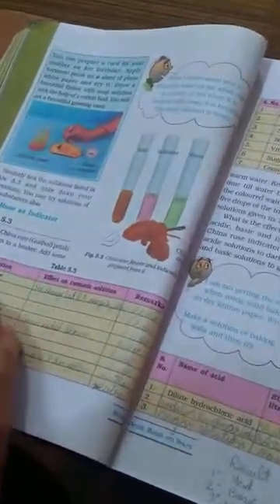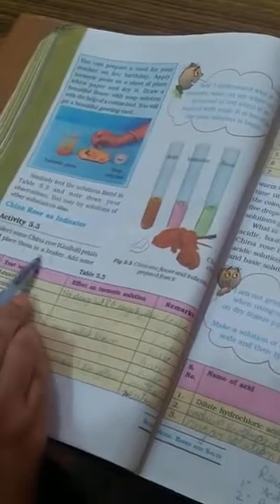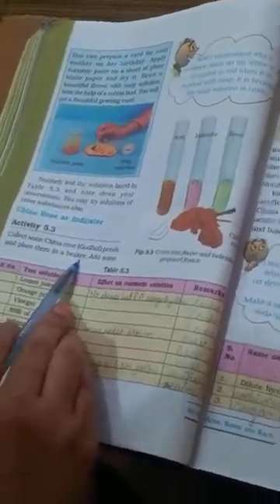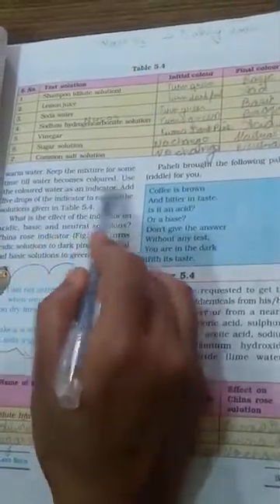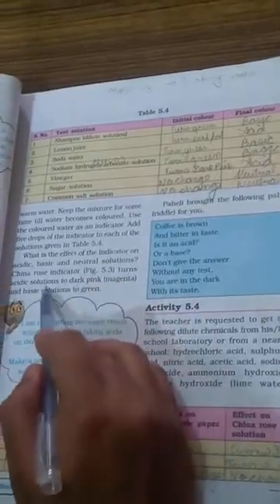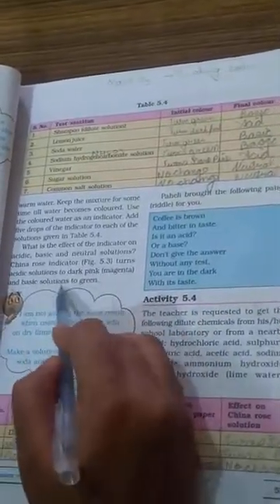It is about china rose. China rose as indicator. Collect some china rose petals and place them in a beaker. I suppose children you all know what is china rose. Add some warm water. Keep the mixture for some time until water becomes colored. Use the colored water as an indicator. Add 5 drops of the indicator to each of the solutions. What is the effect of the indicator on acidic, basic and neutral solutions? China rose indicator turns acidic solutions to dark pink and basic solutions to green. Now we will see it how it changes the color.